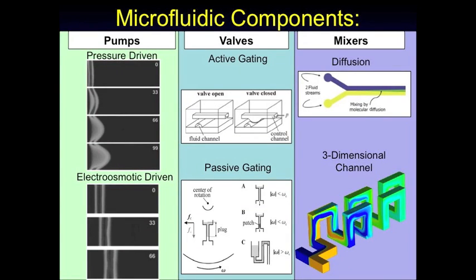Basic components of microfluidic devices covered in this lecture include pumps, valves, and mixers, of which there have been many types described in many publications. These components are combined to build application-specific microfluidic systems.